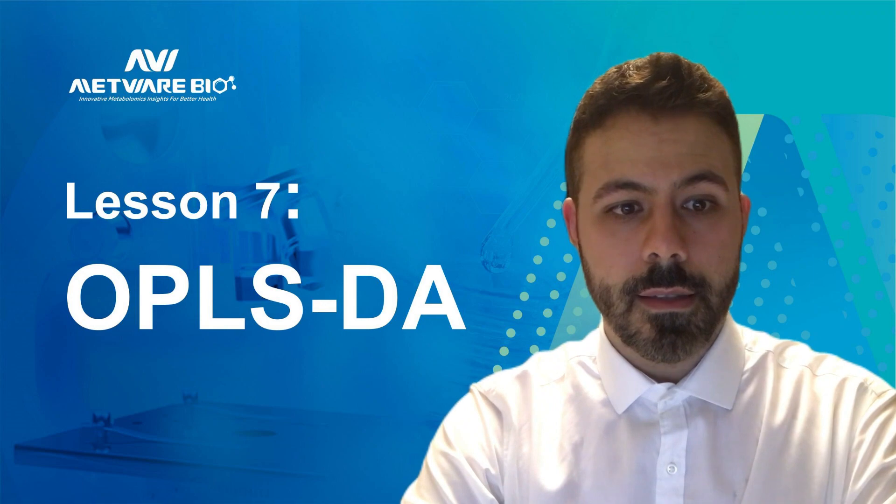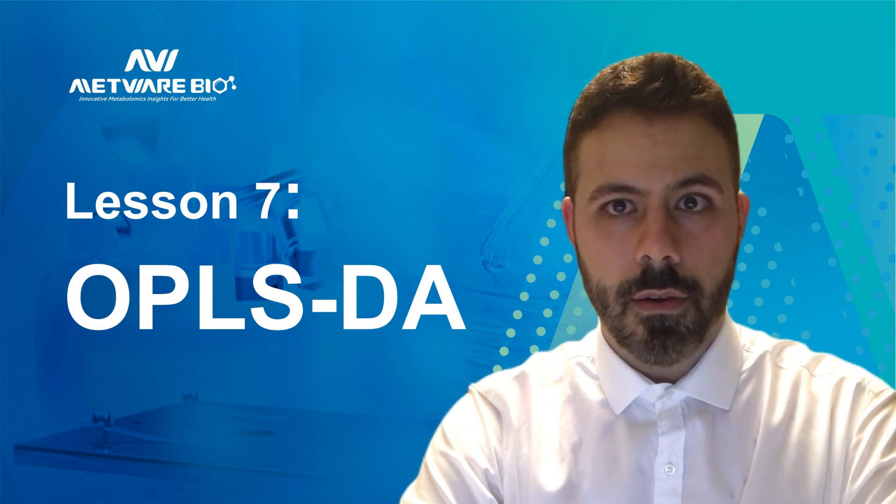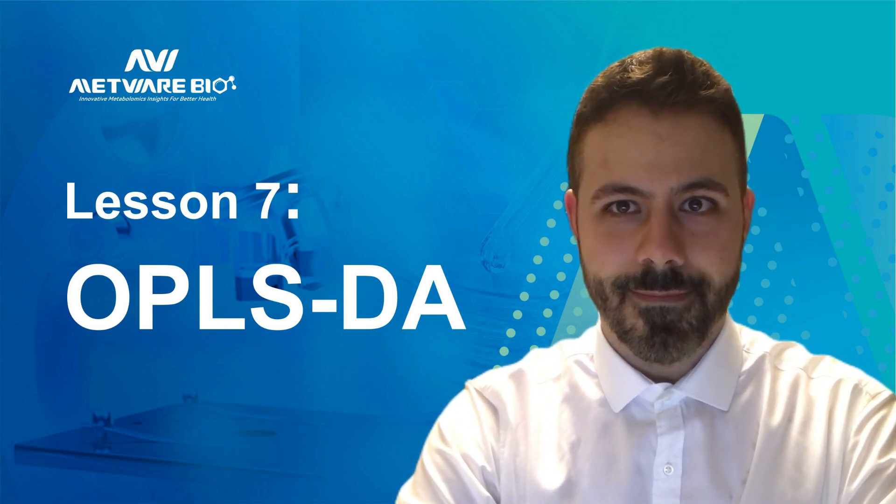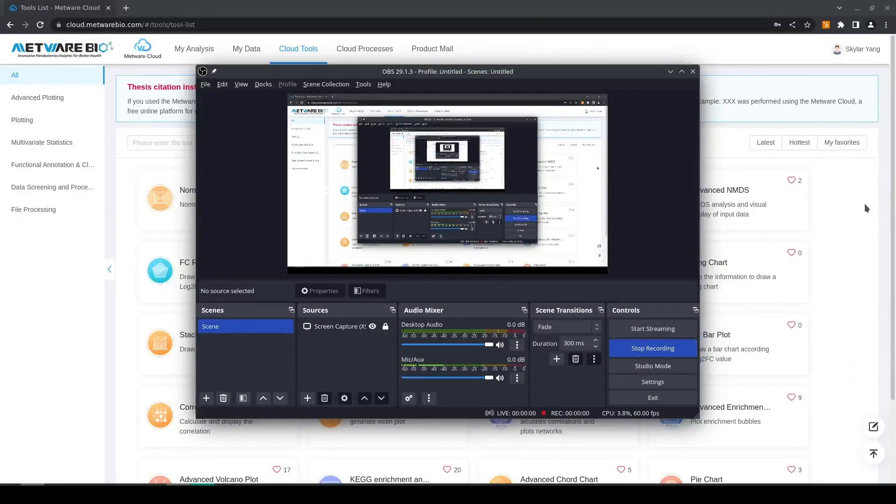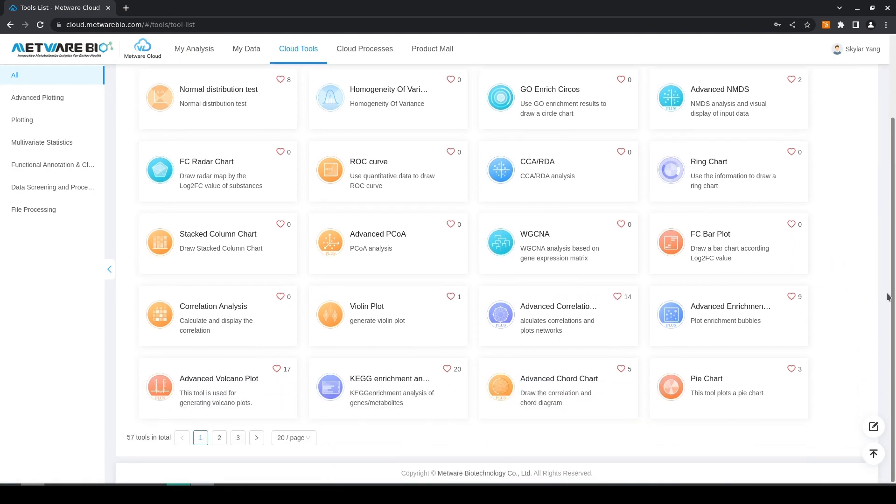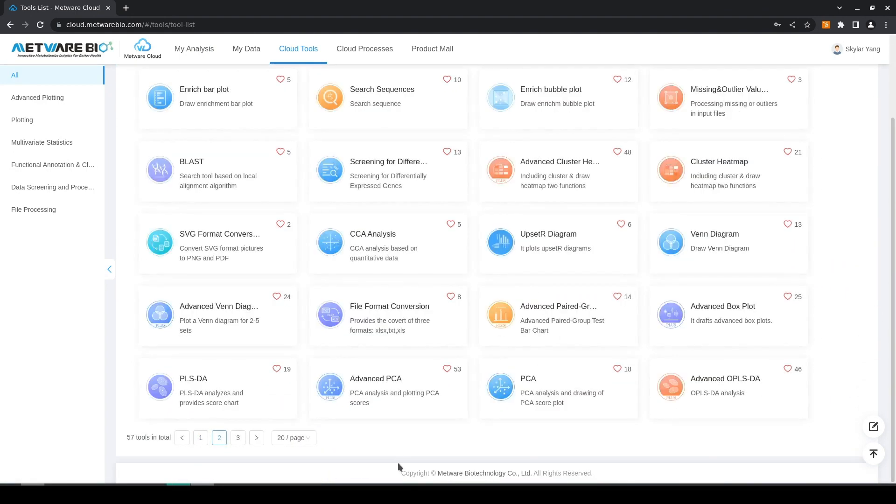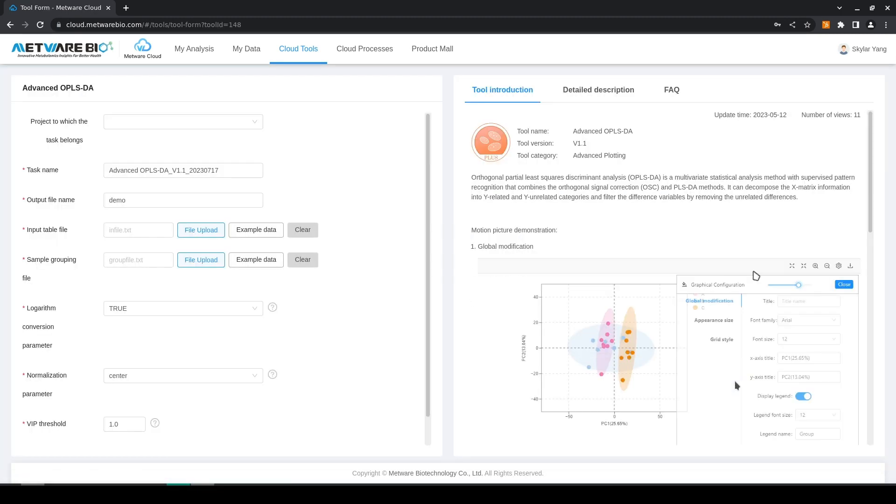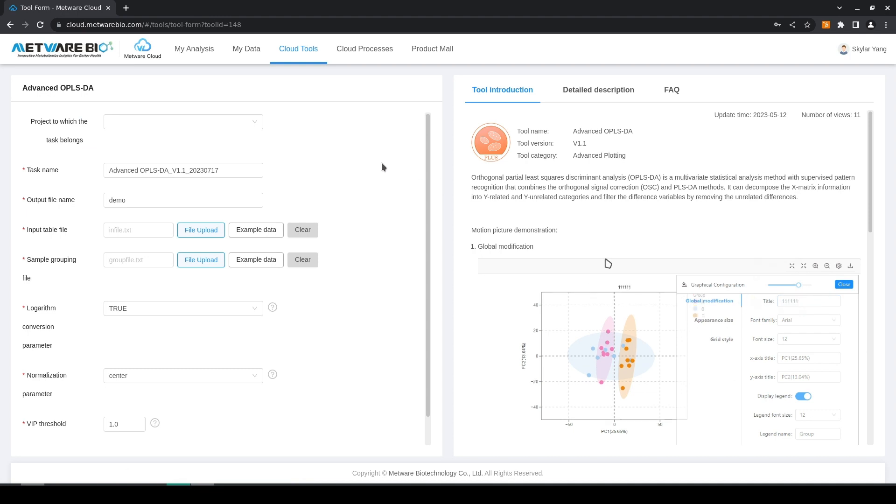Next I will show you how to use the tool. As usual we start from the cloud tool page, we select the tool that we want, this is on page 2, here it is and here is the interface of the tool.